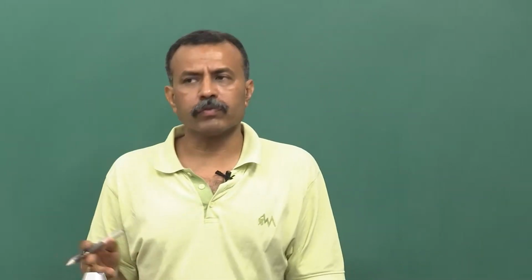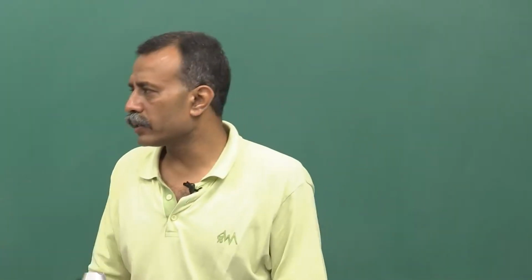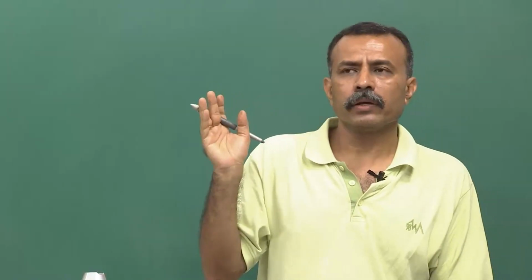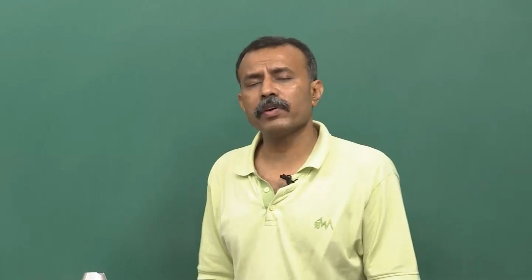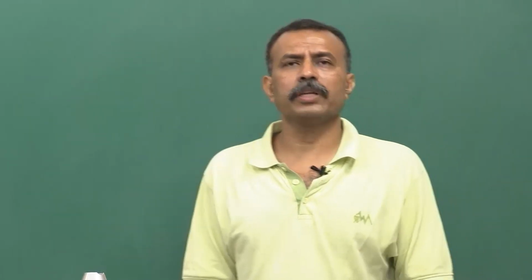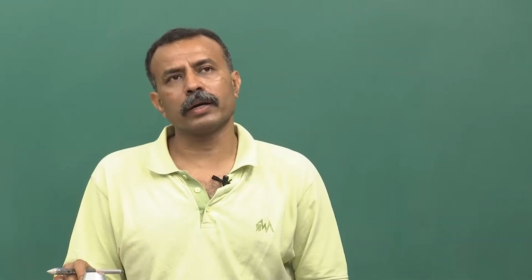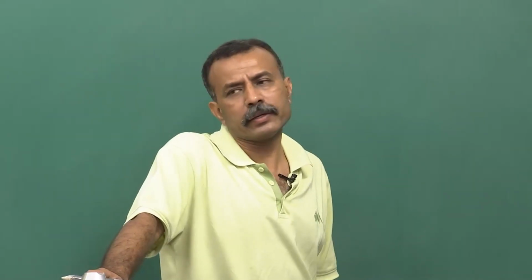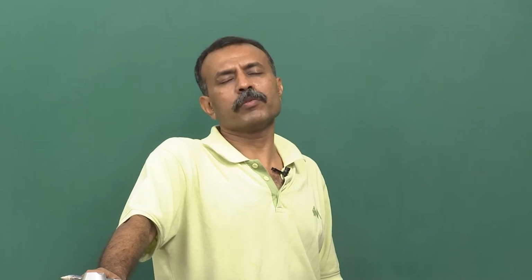You cannot afford to have in one culture 100 cells, in the other culture 200 cells, and in the third culture somewhere in between. Every time, the data you will be deriving from it will go haywire. So, please be very careful. These are things which are not being told, but as graduate students, as an independent PI, you have to be cautious, you have to be very careful.